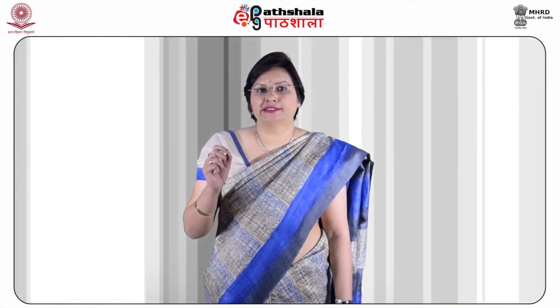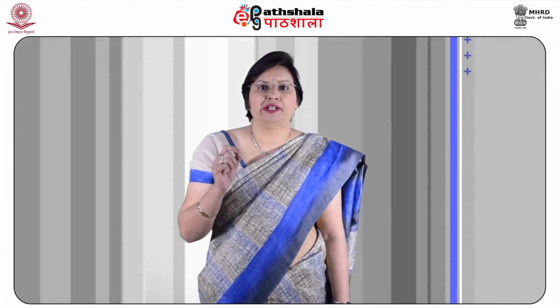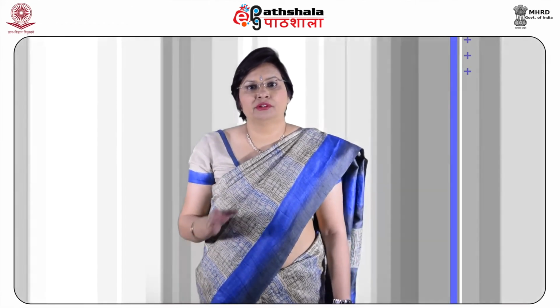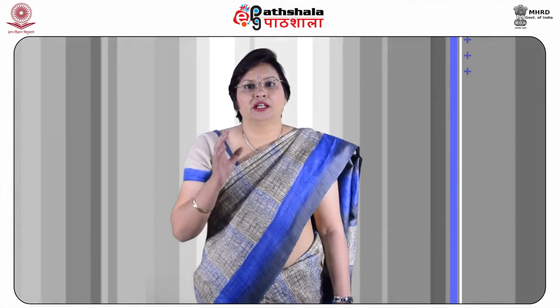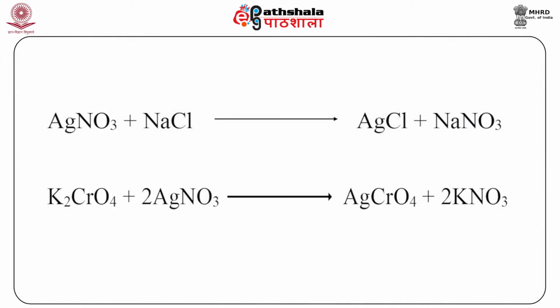The free chlorine reacts instantly with N,N-diethyl phenylene diamine, that is DPD indicator, to form a red color, and this color is discharged on addition of the ammonium ferrous sulfate, that is ammonium iron(II) sulfate solution. In drinking water, presence of chloride is relatively harmless if the amount is below 250 ppm. The chloride content of wastewater is higher than that of the raw water. It is estimated by the argentometric method with silver nitrate solution using potassium chromate as an indicator.